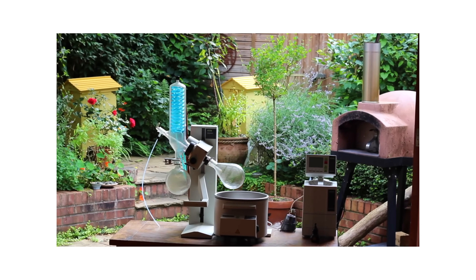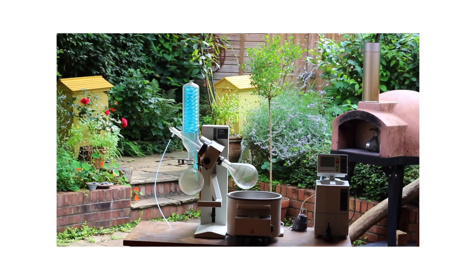To do basically everything I'm going to talk about in this video, you need all three parts of the Rotavap system working together, and that's ultimately the main problem most people might have with it. To have all the parts is both very expensive and takes up a lot of space. But I've got a lot of possibilities and techniques I want to cover before we come to those pros and cons, so I'll start off by talking about the main ways I use this equipment. Basically, there are two broad categories my uses fall into.